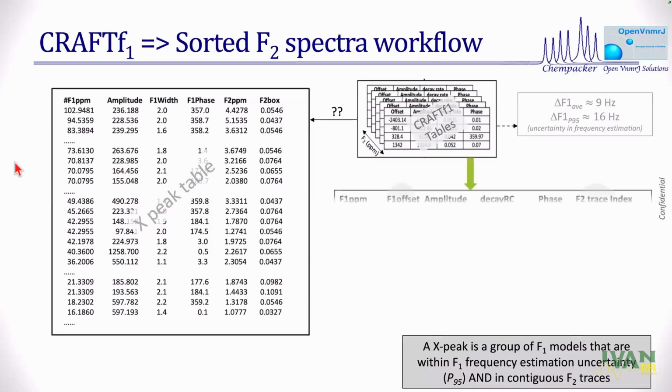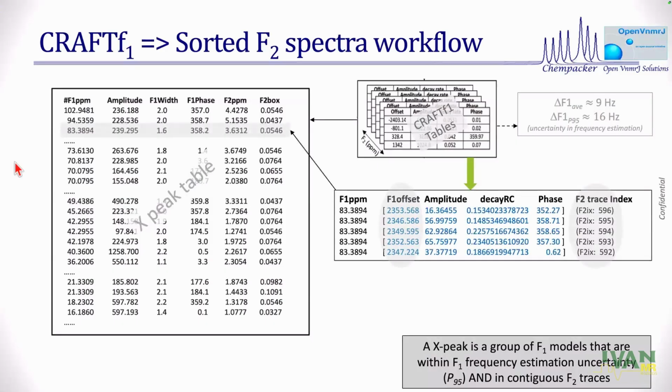If I use that rule, I just go back to this table, the huge table, where there is a table for every F2 point. So if you have 1,000, your Fourier number on that dimension is 1,000. There are 1,000 tables there, or 2,000. There are 1,000 real component tables there.